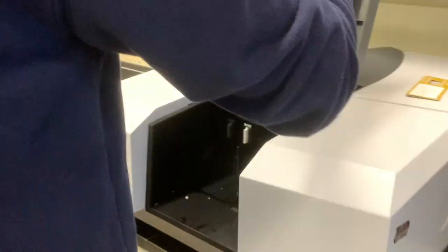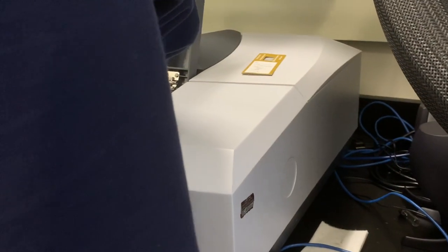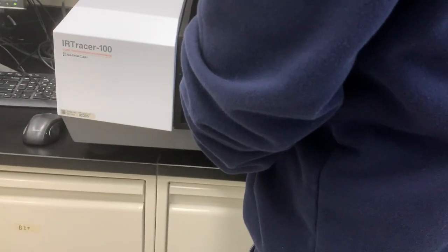We do have to, because once a chemical process is involved, it's complicated. We don't have a chemical hood at this point, so mixing new material is very challenging. And I just noticed that you guys don't have a fume hood.